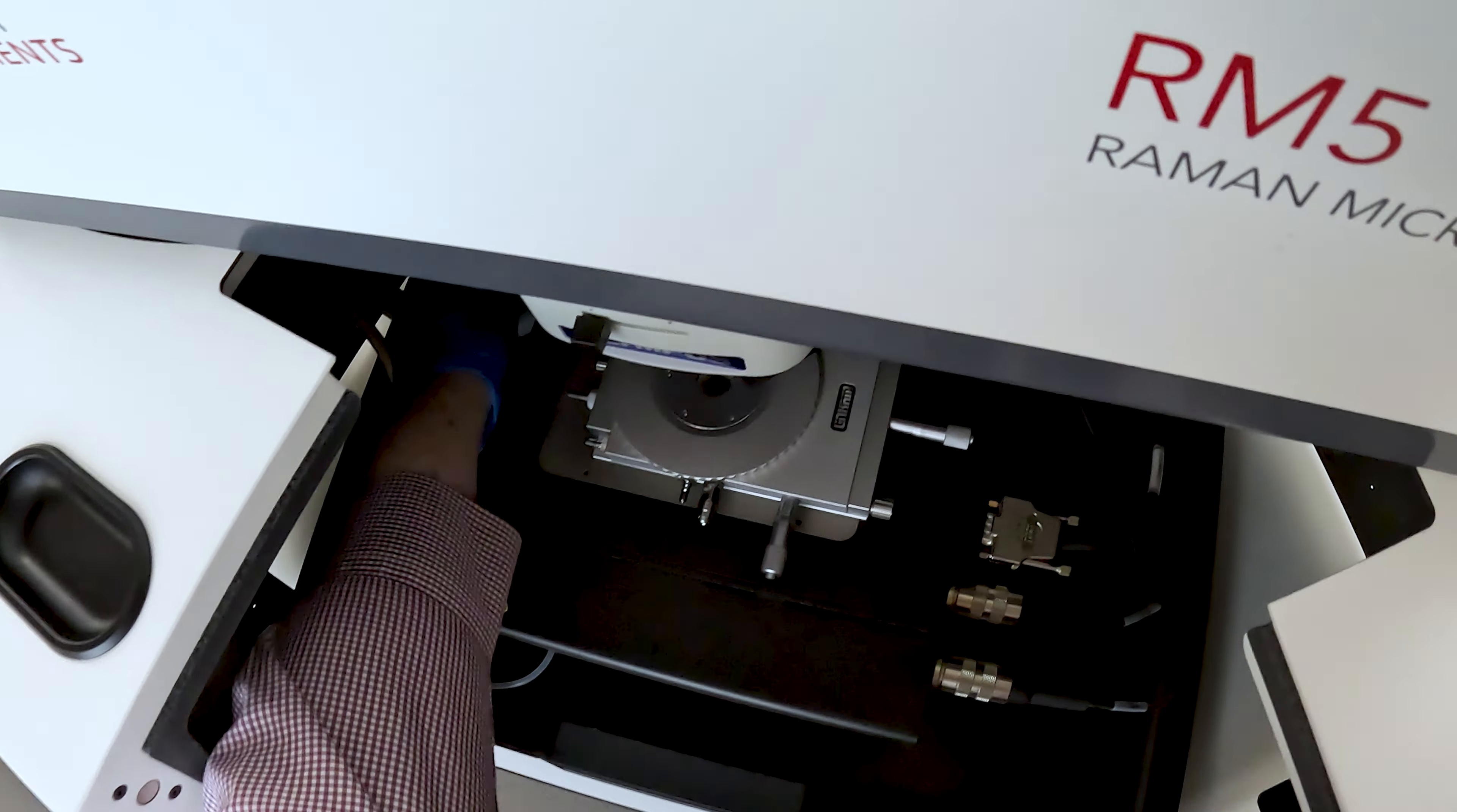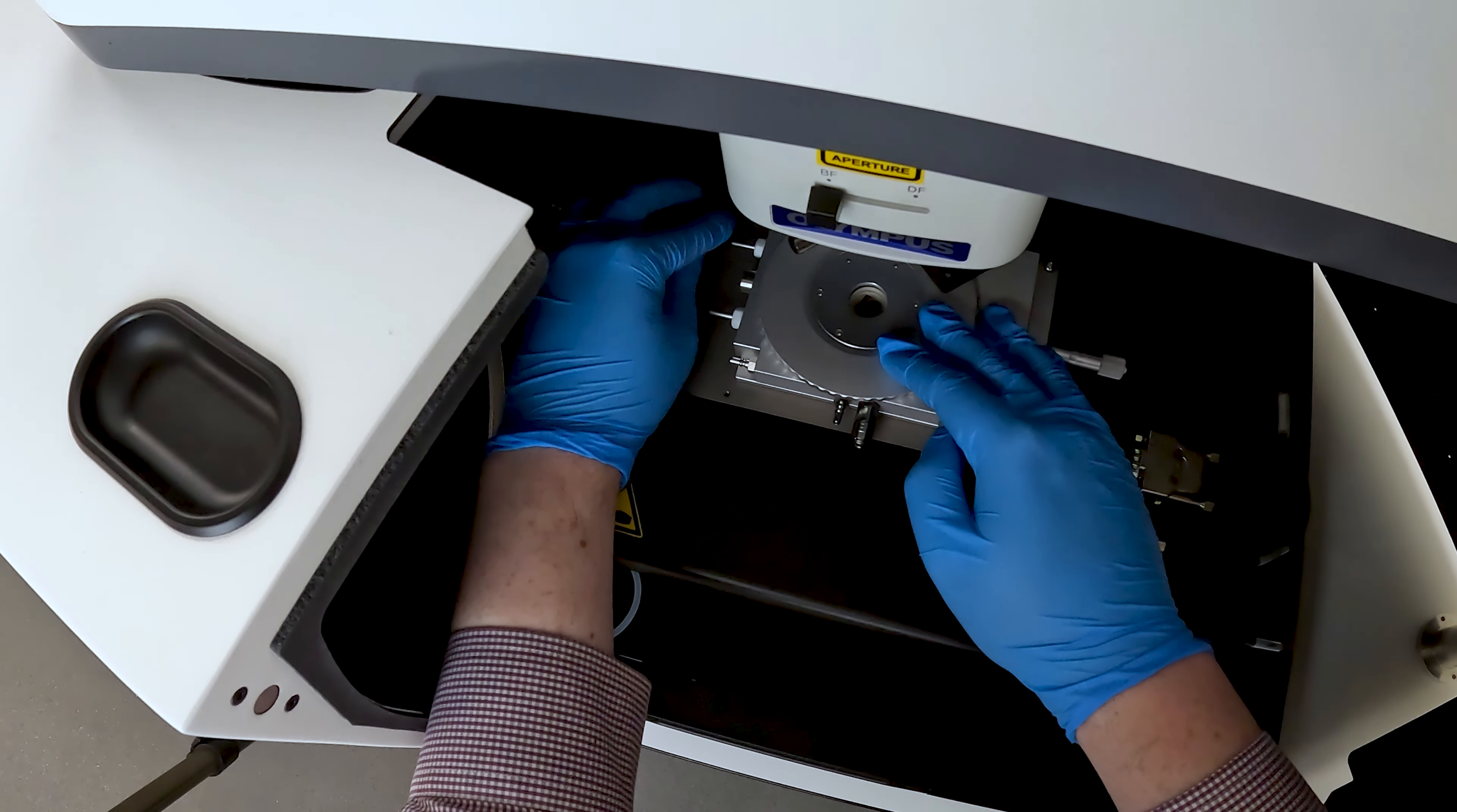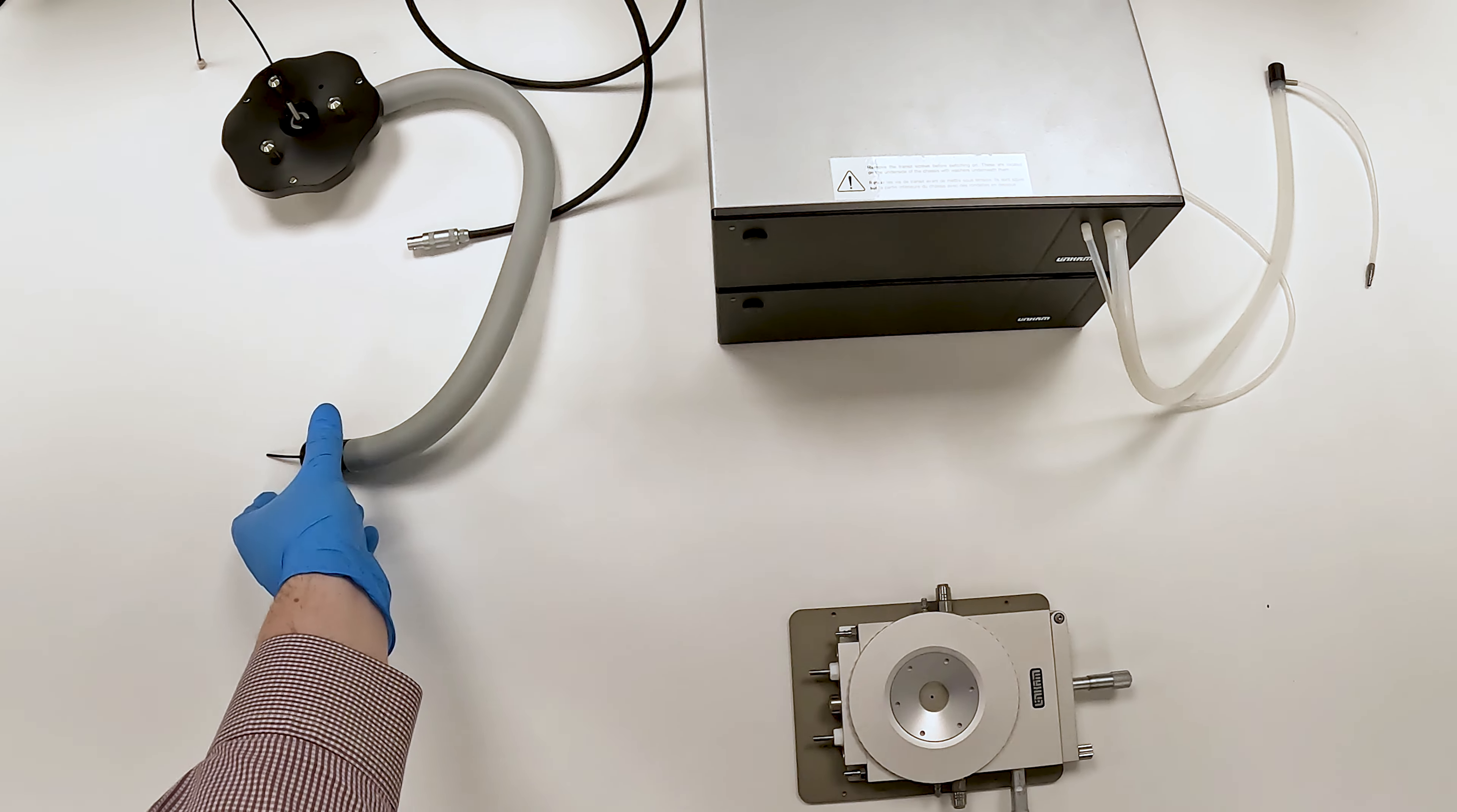For demonstration purposes, we will show you how each cable is connected to the Linkam stage outside the microscope. Remember, the following connections should all be done by feeding each tube and cable through the hole in the external doors of the RM5, when the Linkam stage is mounted underneath the microscope.